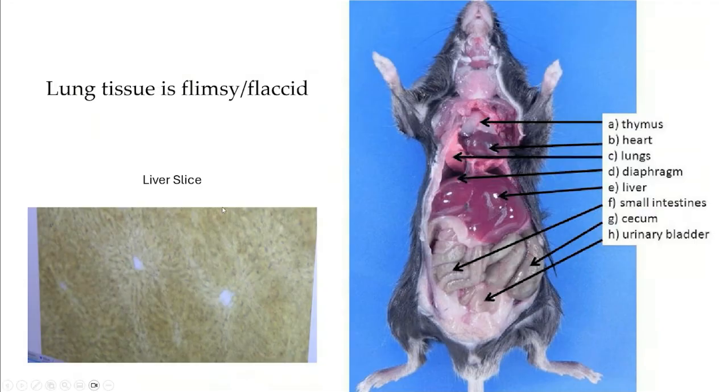Now, what I have here is a liver slice. If you wanted to take slices of another organ, I just want to point out that that's also possible, and show the contrast that a liver can be cut without any inflation because of the consistency of the tissue. Because of its durability and its consistency, it will not need to be inflated with any agar. You can cut it. You can see the hepatic lobules here, and they're very beautiful. So you can obtain slices from other organs if that's of your interest.